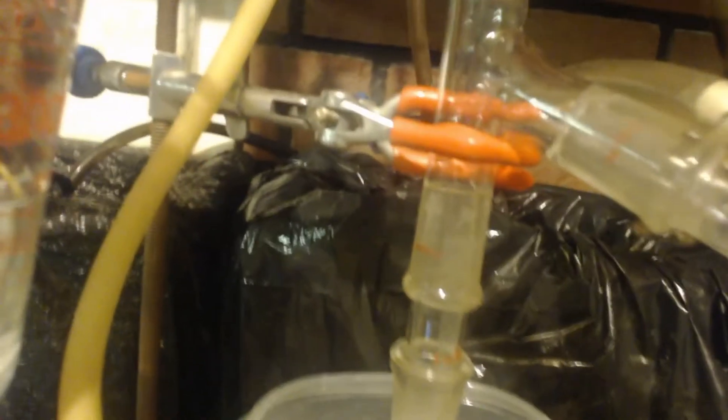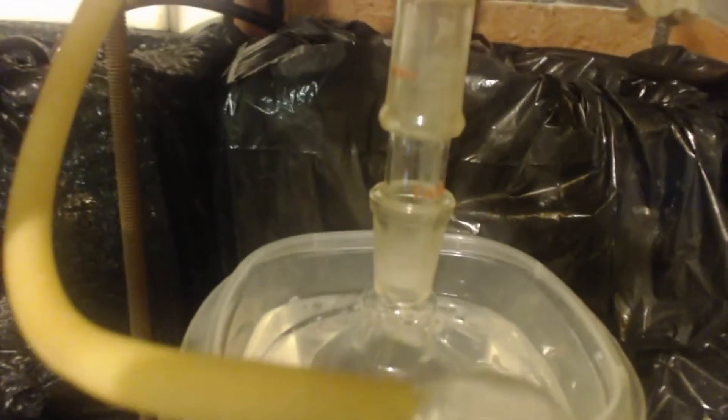It goes through that valve and into a Y. Just like the first setup, it's got a receiving flask, but it also has a condenser — this one has two condensers. The first is a Liebig with just a tube in it; the second is a Graham with a coil type. So anything that gets past the first condenser and past the bubbler still has to get condensed here. It will be very cold by then, because all these things are on ice.